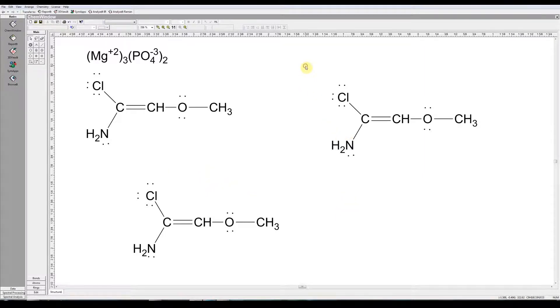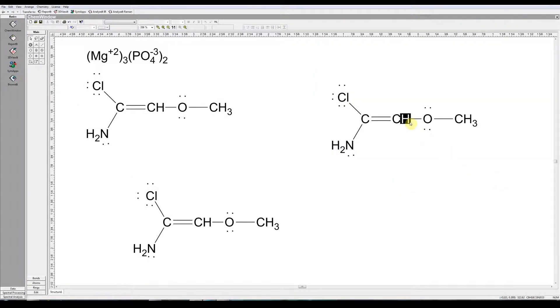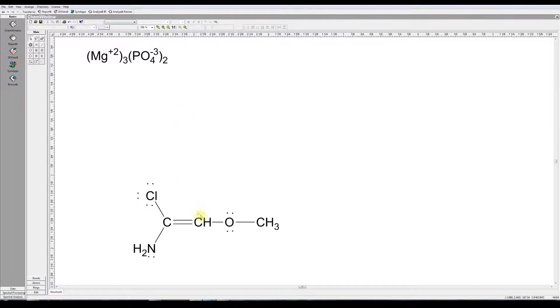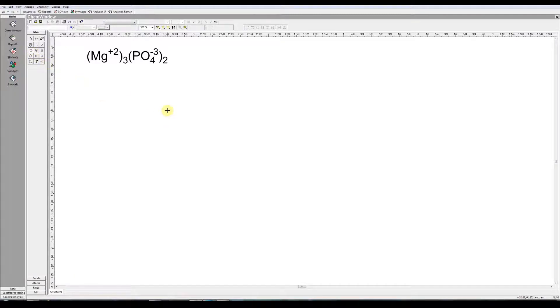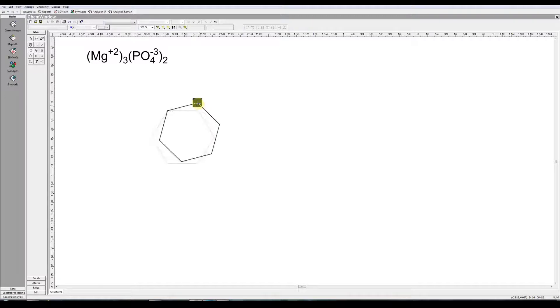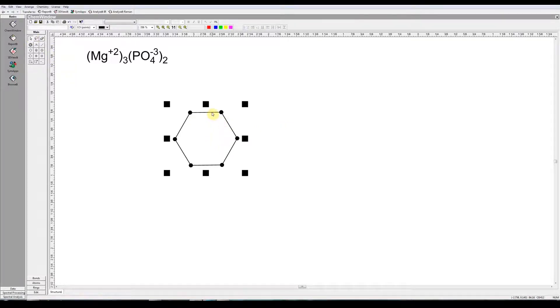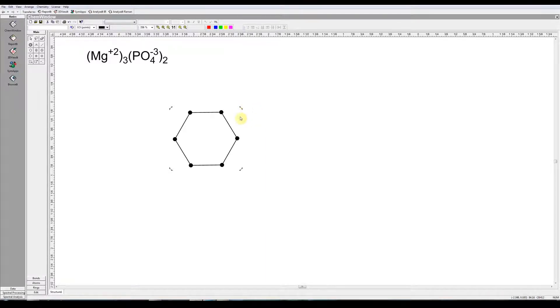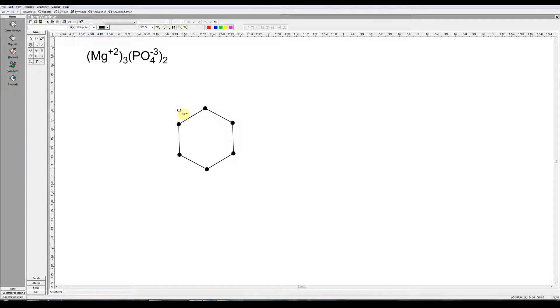Let's start with something new. Let's draw a cyclohexane ring. So here it is on the main group. Now when you draw this, simply click, but don't release the mouse yet. Just rotate it around and you'll notice that you can adjust the angle before you release it. Using the selection tool, if you click on the ring, then click a second time on one of these circles. Notice the handles have changed and now they look like a rotation tool and that's what they are. So move the mouse around until you see two curved arrows. Now click and drag. You can rotate the ring to whatever angle you want it to be. Let's put it vertical. It tells me the angle. Notice as I'm rotating it. I'll release it when it gets close to 90.